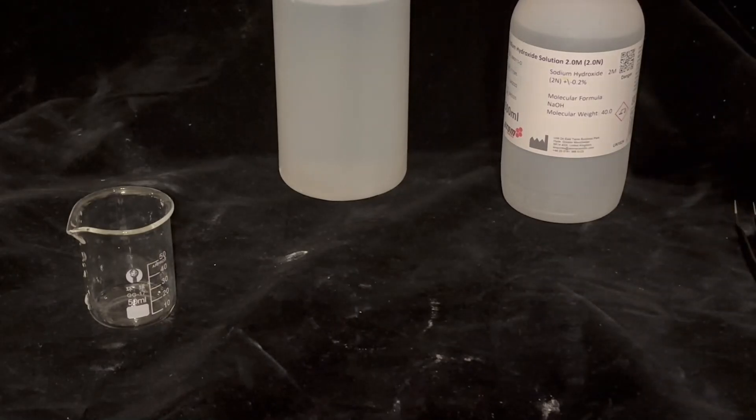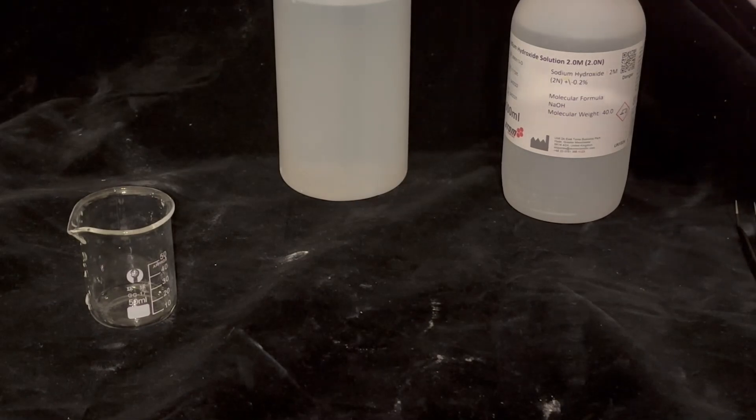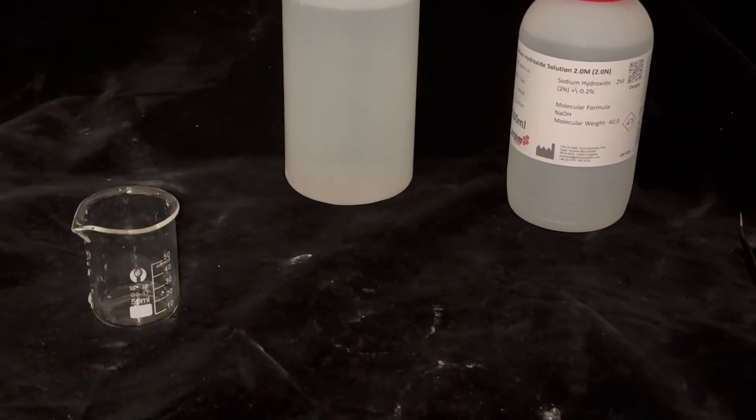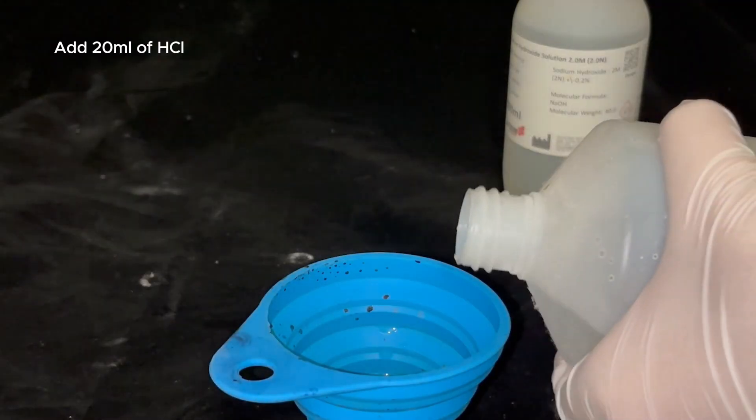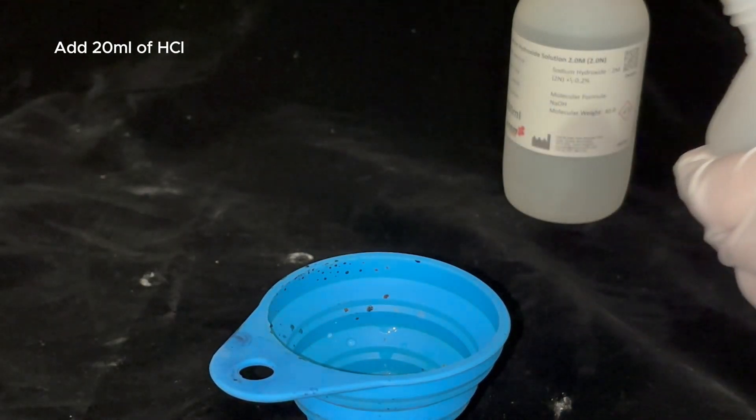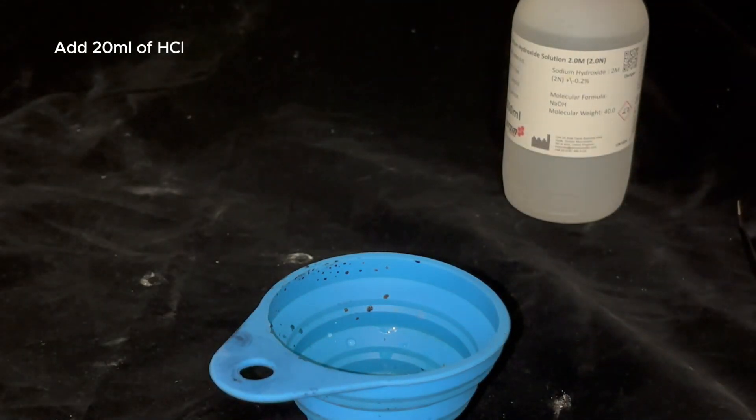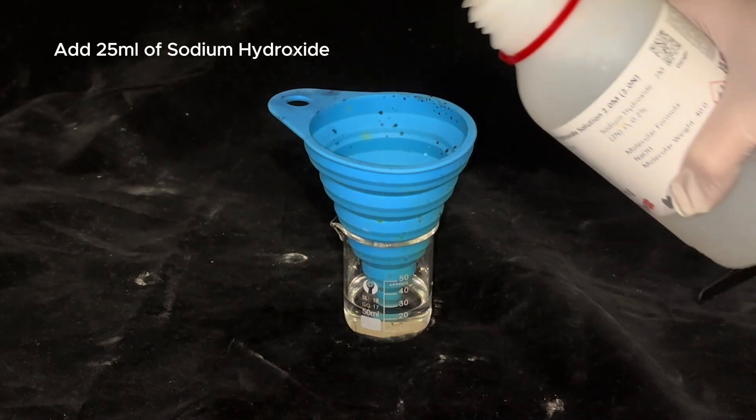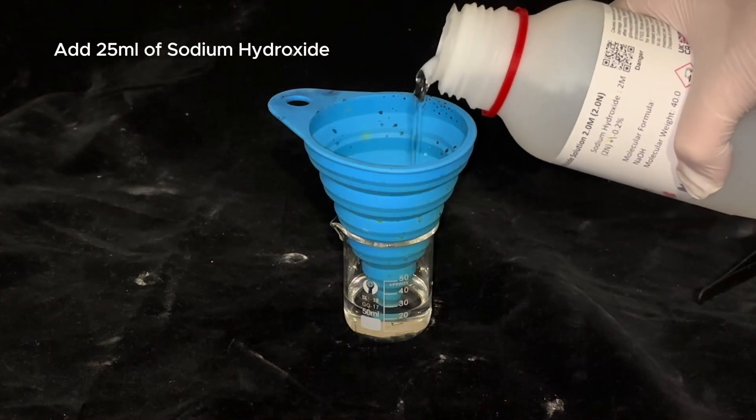I started by gathering what I needed to do this experiment. First I added 20ml of hydrochloric acid into a beaker and then 25ml of sodium hydroxide.